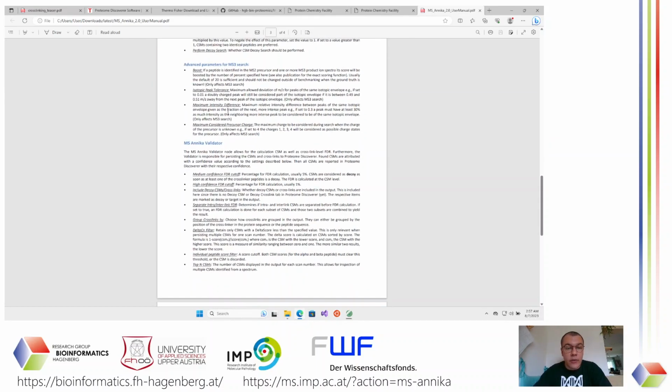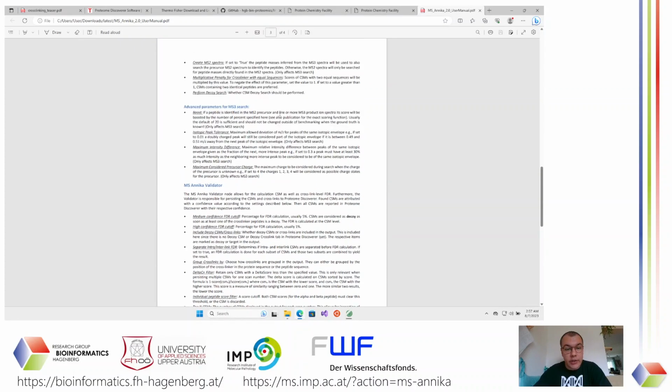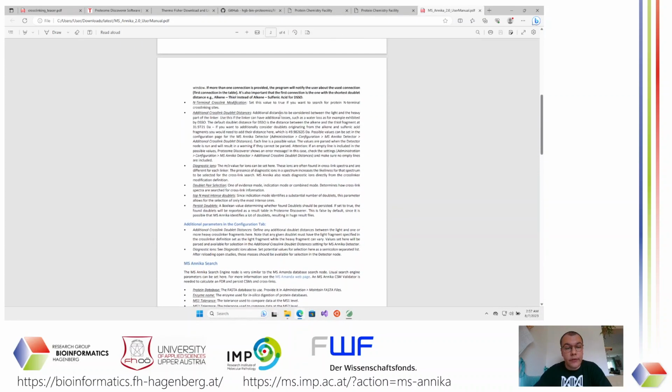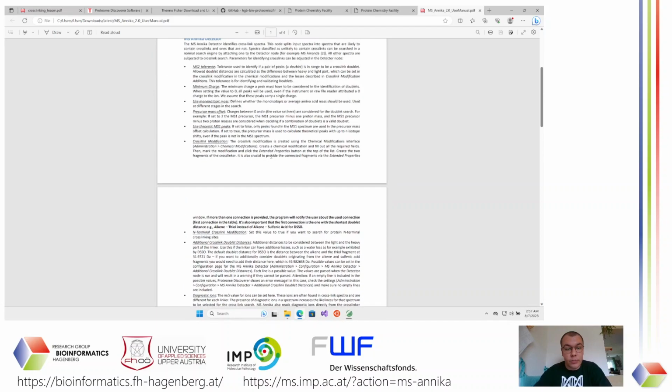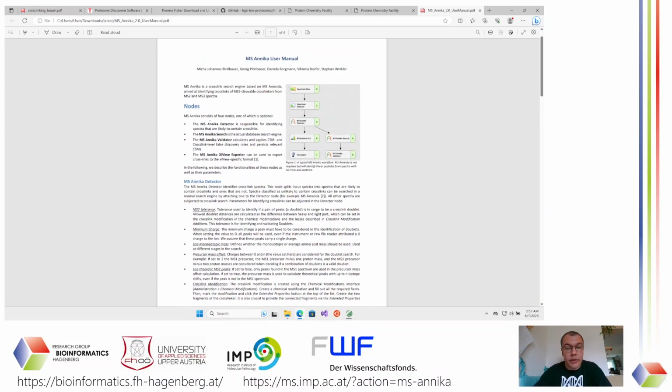But I will cover the most important ones in this video, and most of them you will probably never touch. So if you're interested, you can go through all of that, and if you're specifically looking for an explanation for one of the parameters, this is where you can find it.